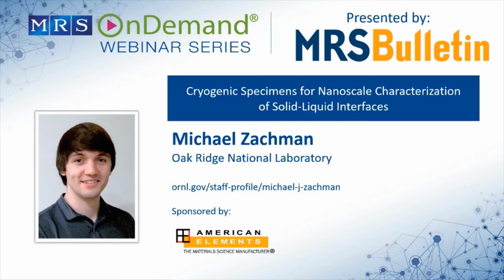And then, well, first of all, someone's just confirming that you're using water instead of platinum in order to weld the sample onto the needle, which I think you explained carefully that's what you were doing. But someone's also asking, just confirming that you were using a gallium FIB. But we might broaden that question out a little bit and ask, is a gallium FIB the best tool to use for this? Would a different plasma FIB or something like that be a better choice?